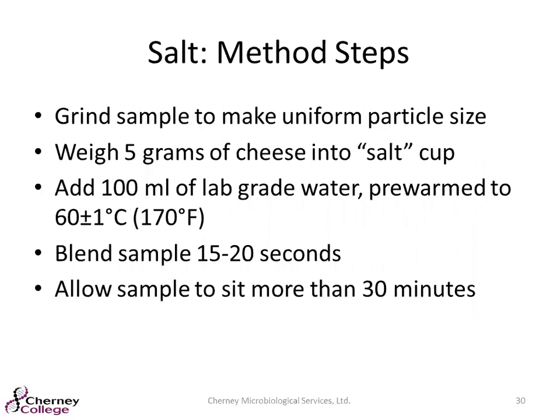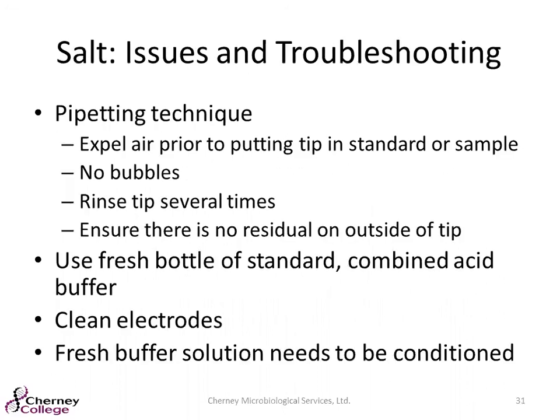The last method that I'm going to touch on is our salt method also. That's another one that people really like to come in and see because they have questions on it. So here you're going to grind that sample again to uniform size. We're going to weigh it out, add some warm water, and you're going to blend it. The key piece then is letting it sit for those 30 minutes to really get those salt ions to separate out from the actual sample. A lot of customers or labs that have come to see, that's a piece that they miss. So really making sure that those sit for those 30 minutes.